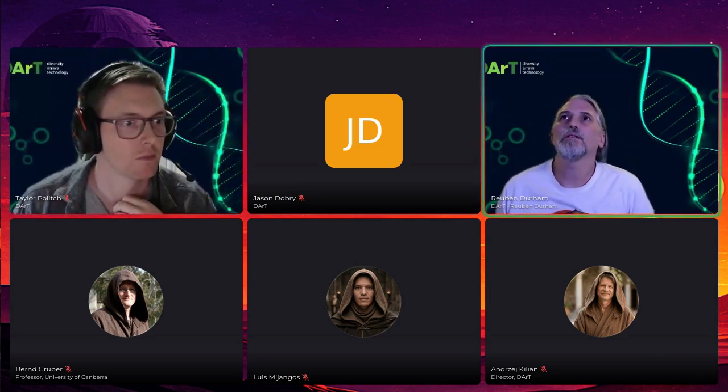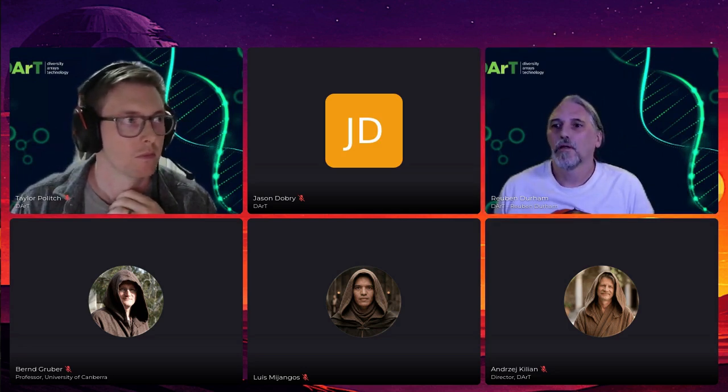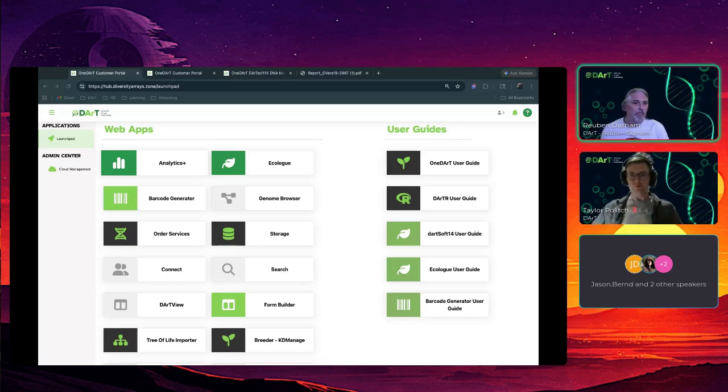Do a quick screen share here. Okay. Thank you. This is Ruben again. I'm going to rejoin the process, imagining that we have done our submission to DART for DARTSec or a similar process, and we've gotten our order back. That is in our storage.